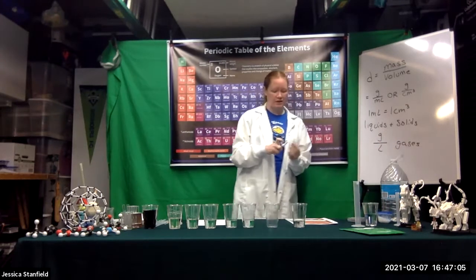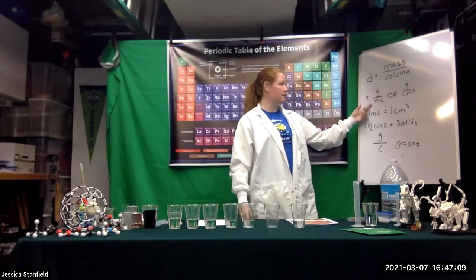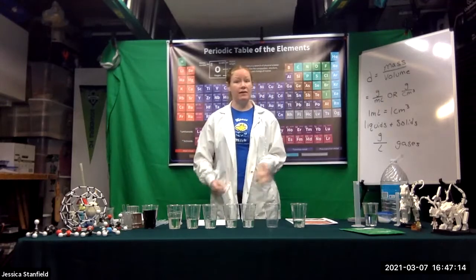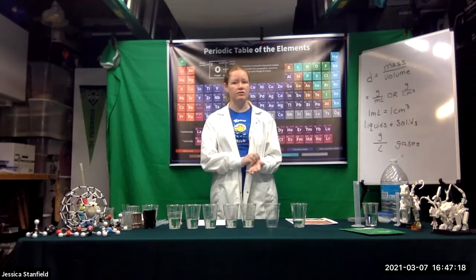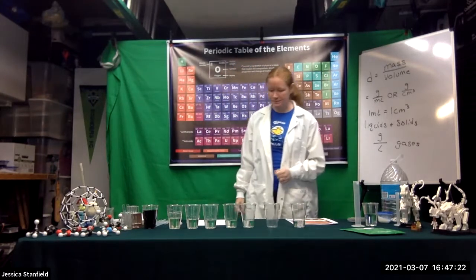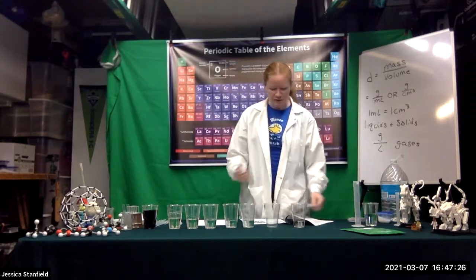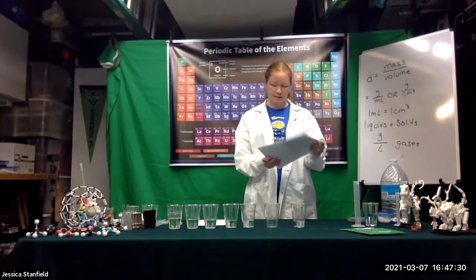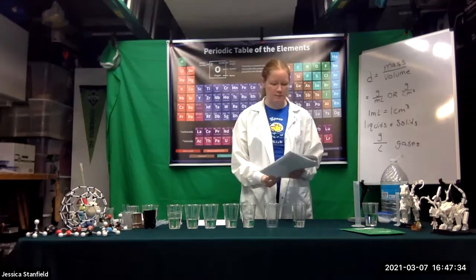Because we're dealing with solids and liquid solutions in this lab, we will be dealing in grams per milliliter or grams per centimeter cubed, depending on what we're using to take our volume measurements with. Later on this semester in your Chem 100 lectures, you should be learning about gases, and that's where you'll use that grams per liter. All right, so the first step is we need to read through our experiment and do our pre-lab. And then we can look at our materials page on page 5 and start gathering all the supplies we need for our experiment.